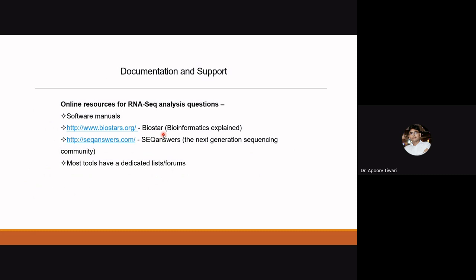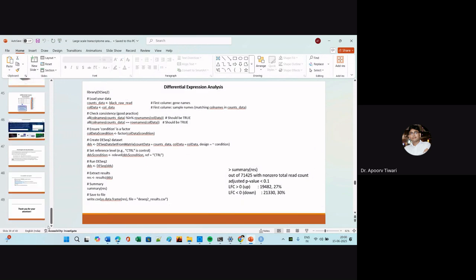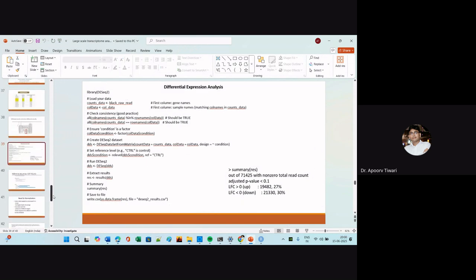So these are the online resources we have, as we have discussed. These are the basic slides with which you can perform transcriptome data analysis of your samples.